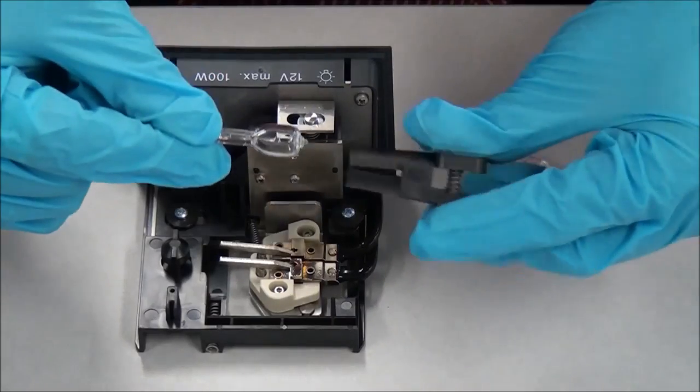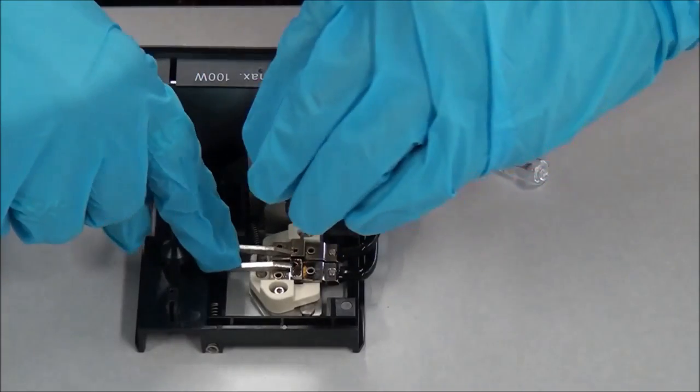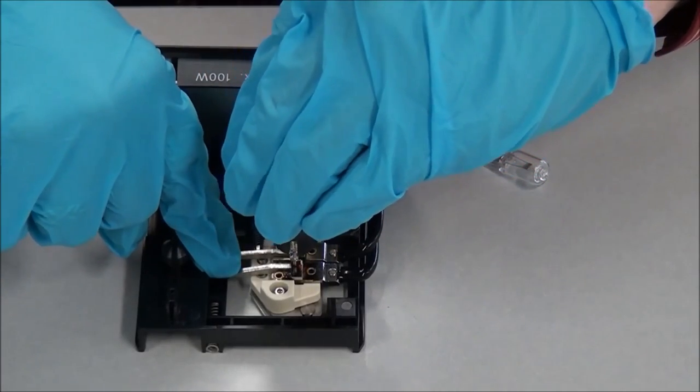Depress the two spring clips again and fully insert the new bulb into the socket. Release the spring clips and remove the replacement tool.